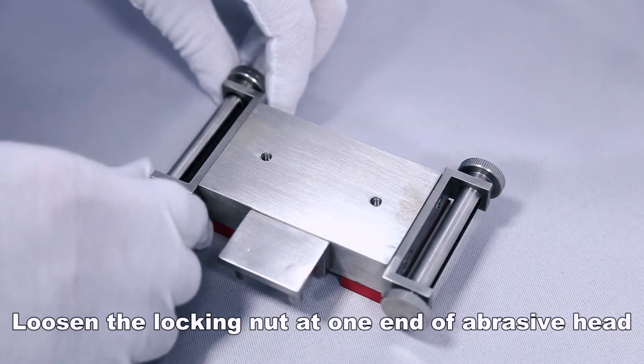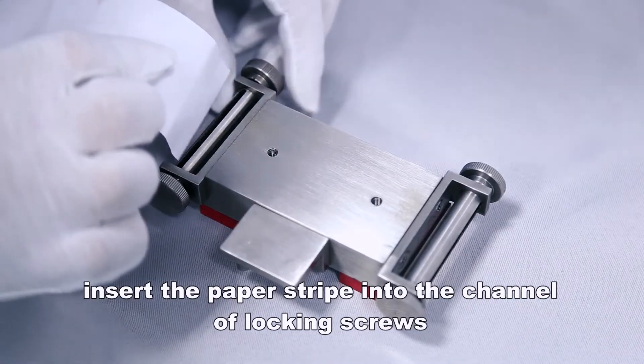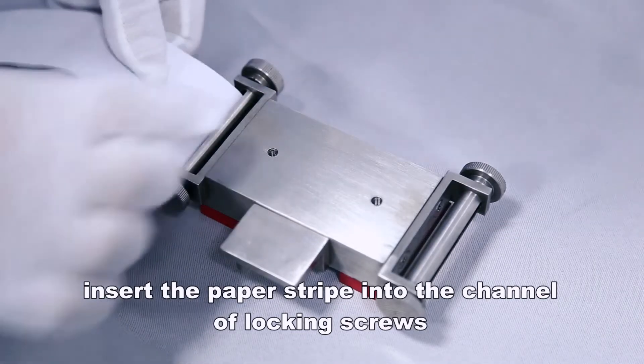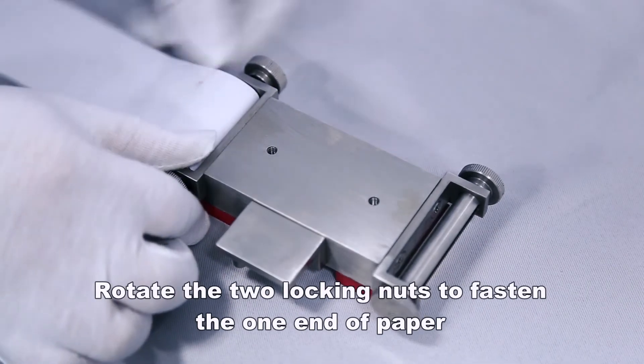Insert the paper stripe into the channel of locking screws. Rotate the two locking nuts to fasten one end of the paper.